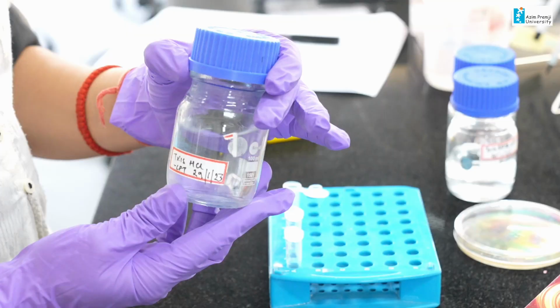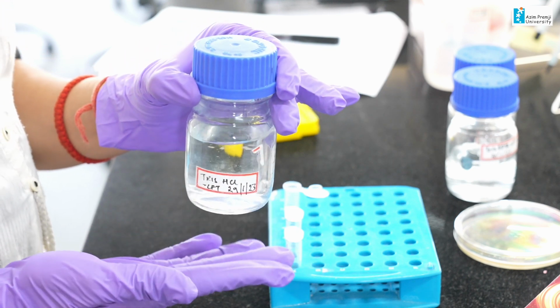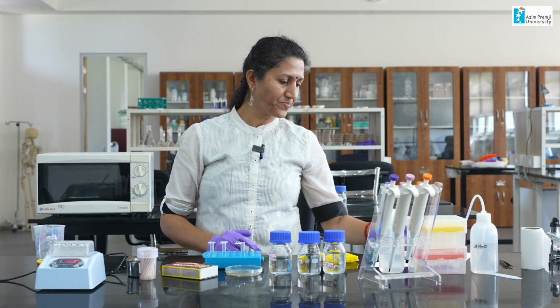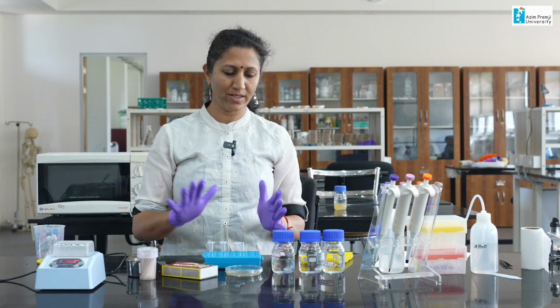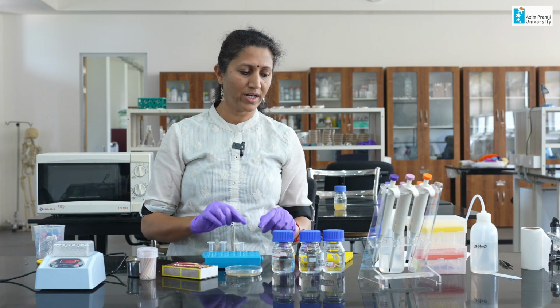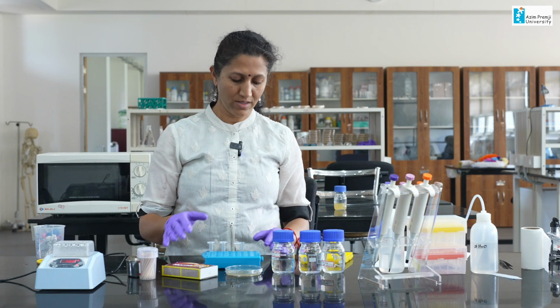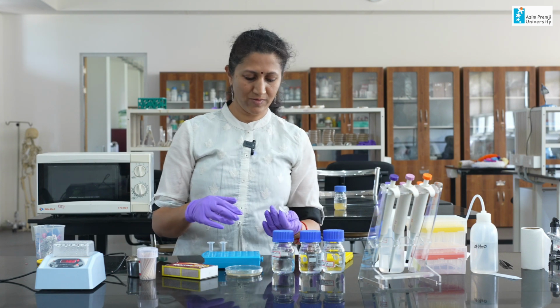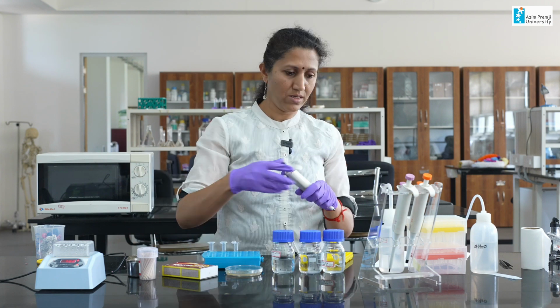Then you have a Tris-HCl solution, which is used to balance or maintain the pH of the solution. This is just a 3-step protocol where I am going to add 3 different reagents, keep it in the water bath, take it out, and directly use this lysate for PCR amplification. So, let us start with pipetting the first reagent.